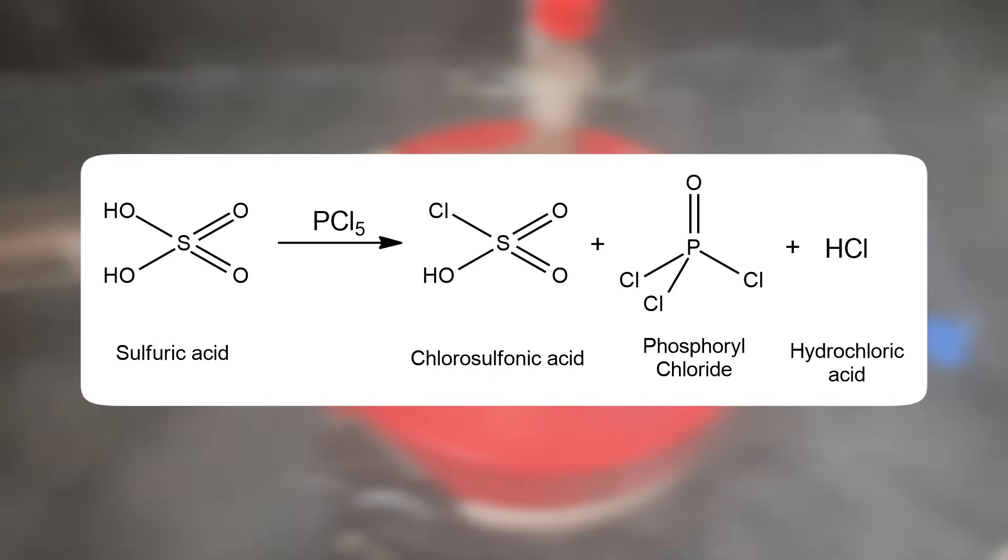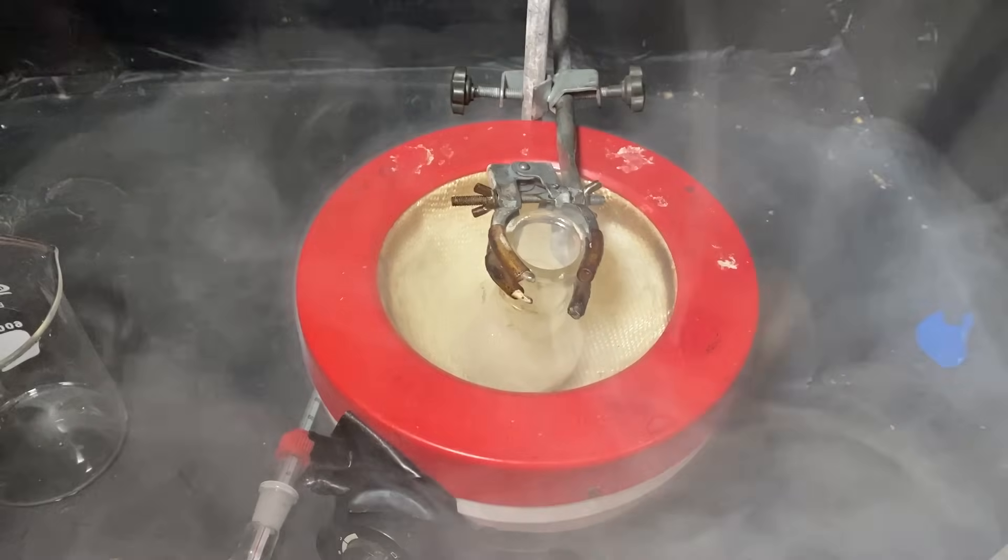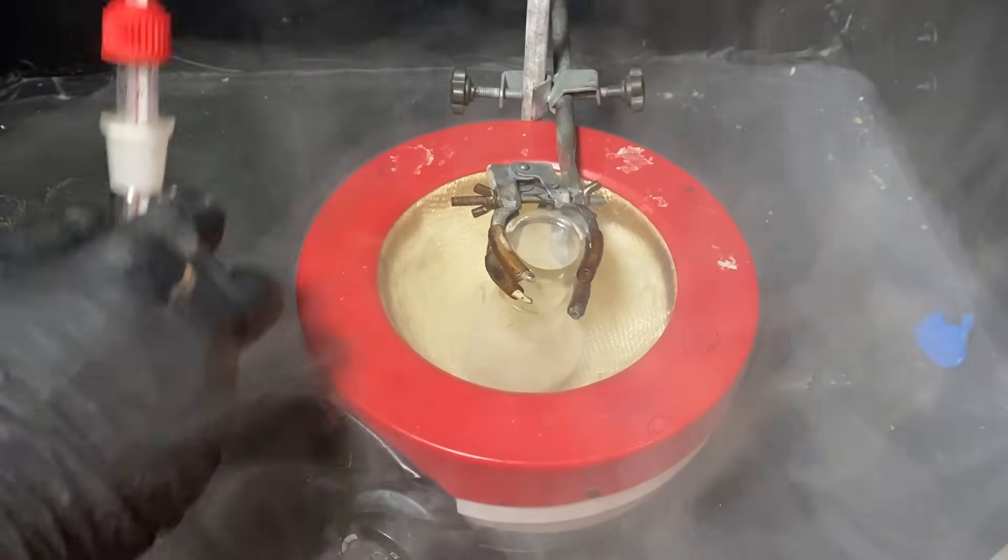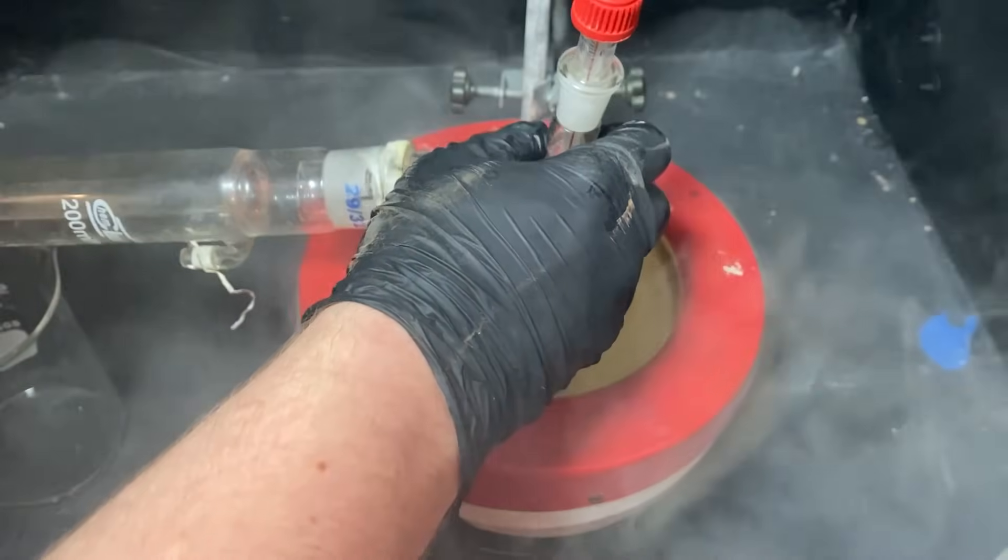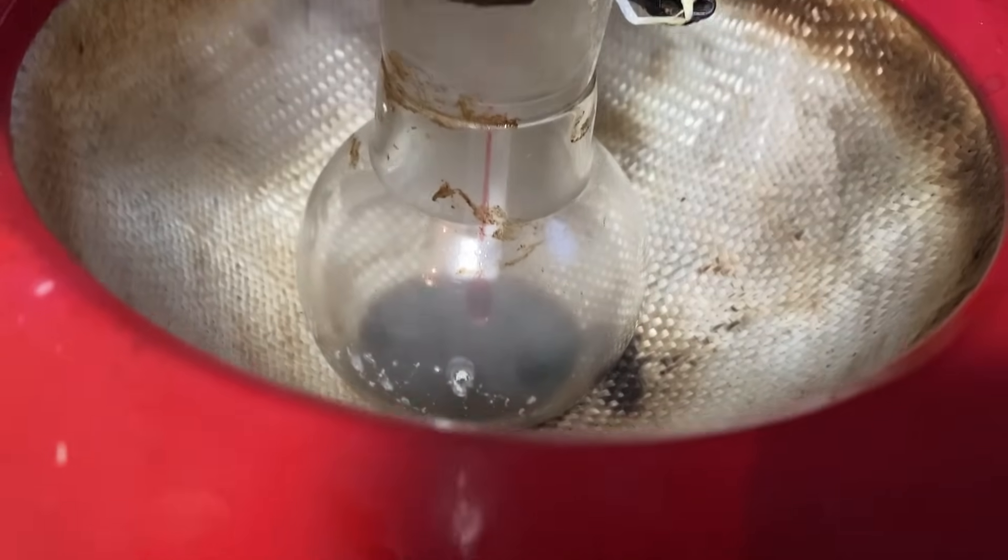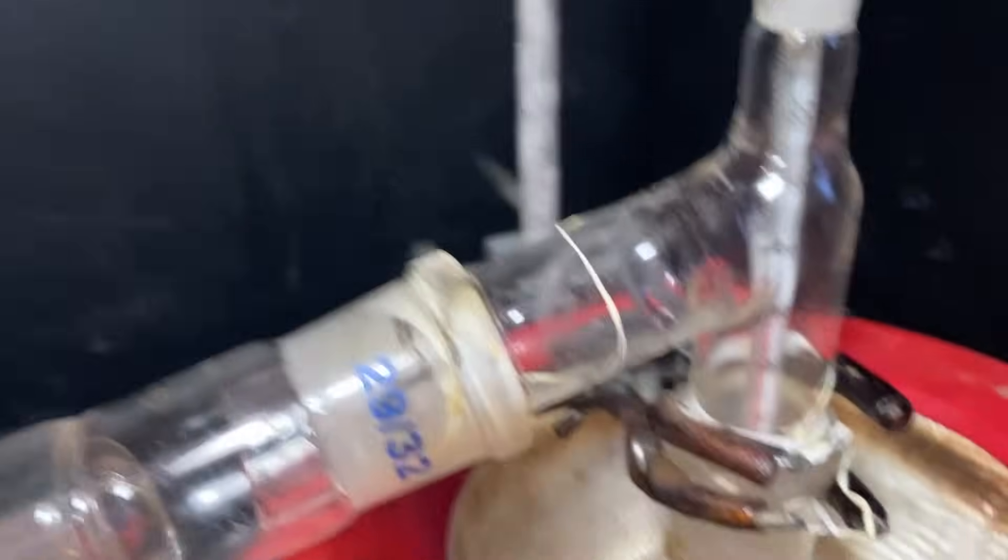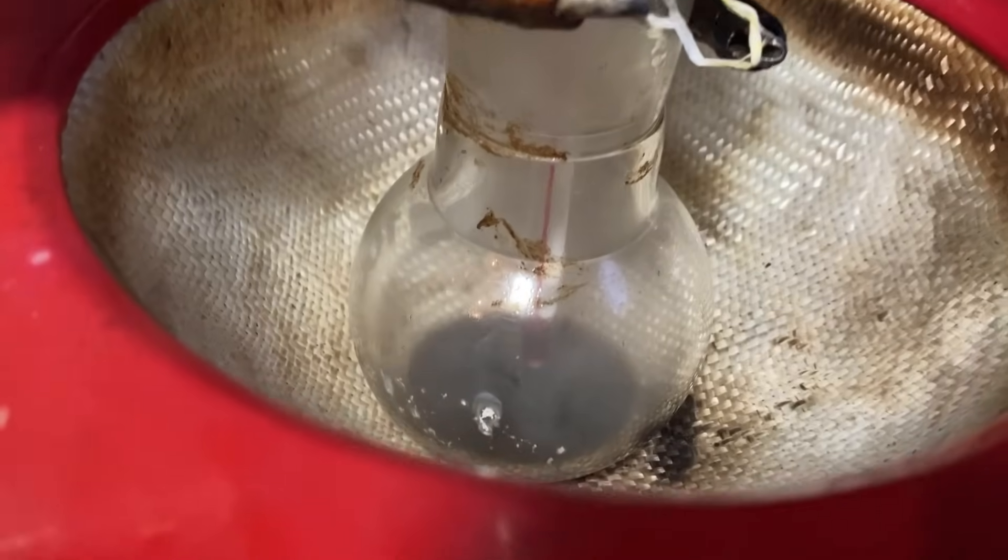And you can separate the two using distillation. So I've quickly attached a distillation apparatus to the boiling flask, which I've prepared beforehand. Then I've cranked the heating of my heating mantle to the max. This part is pretty boring, so I'll spare you the details.